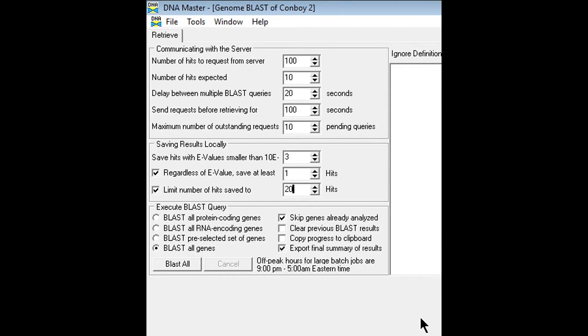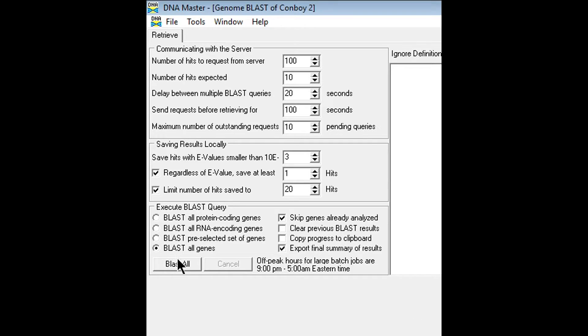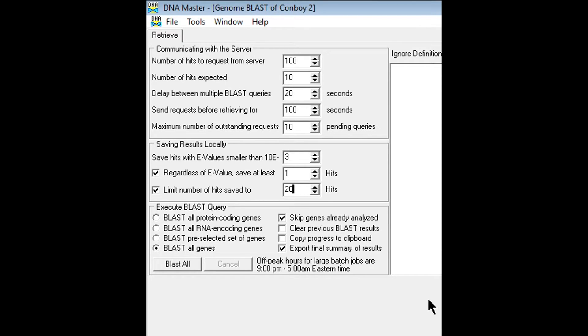This is going to take a very long time as I mentioned and the program is actually unusable during this time. You can just leave the program running as soon as you hit blast all. It may say not responding sometimes and it may look like the program froze, but just be patient because it does take a lot of time. So we're going to go ahead and click blast all.